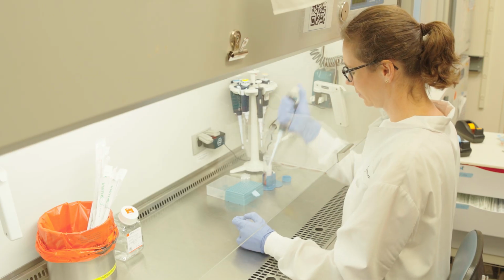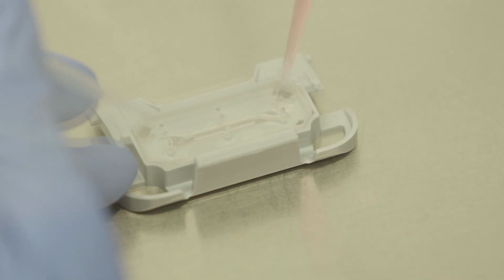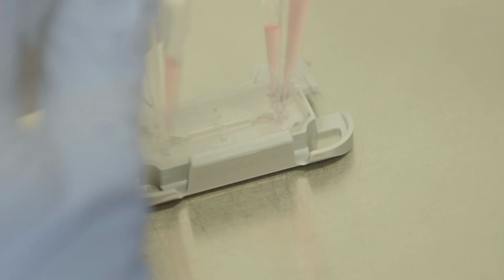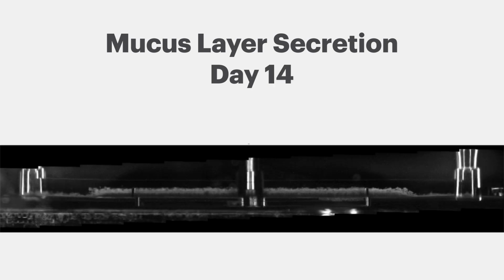So we isolated cells from patient resections from the colon and then used these patient-derived epithelial cells to create the colon chip. These cells produced mucus-producing cells that were then producing and secreting mucus, which accumulated and formed this mucus layer with this inner and outer layer. The outer layer can be penetrated, for example, by bacteria, whereas the inner layer is protecting the cells.